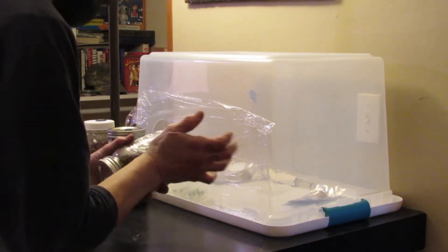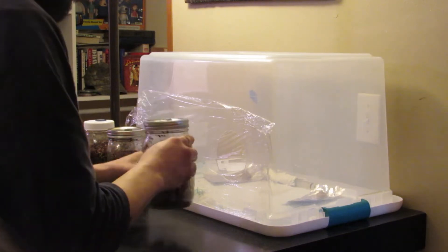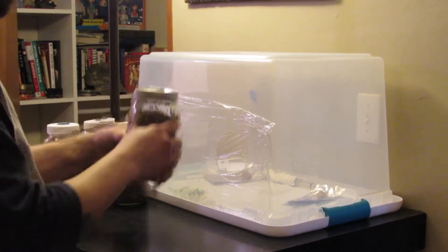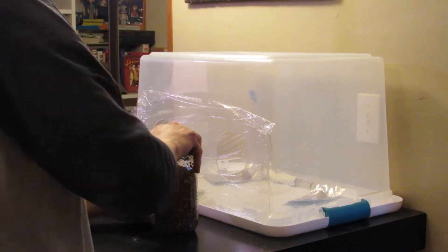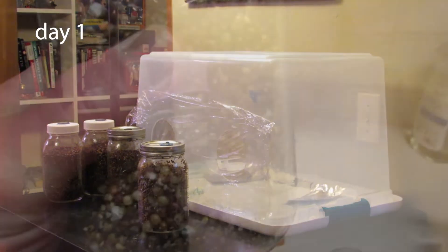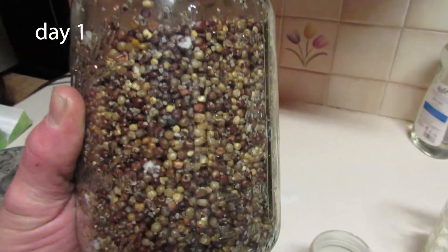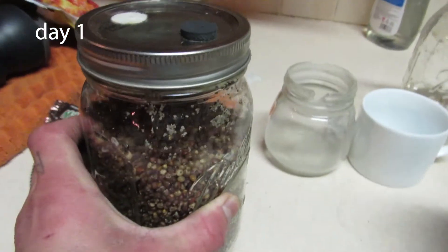And there you have it, folks — it is that easy. Now you just leave your jar standing up right side up and watch the mycelium grow. I filmed these same four jars over the course of a week, just so you can see for yourself how effective this method is.